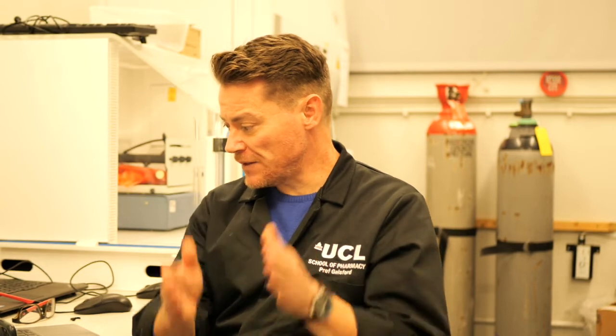So a collimated beam is a beam where all the electrons are going in the same direction, so vertically down in this instance. Then they are passing through the sample. Your sample needs to be relatively thin in order to allow the electrons to pass through it. If the sample is thick, then the electrons will simply stop.